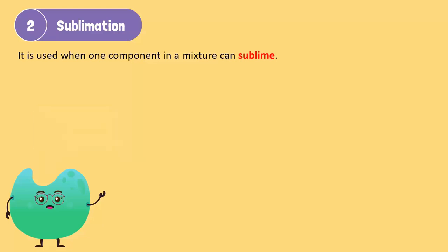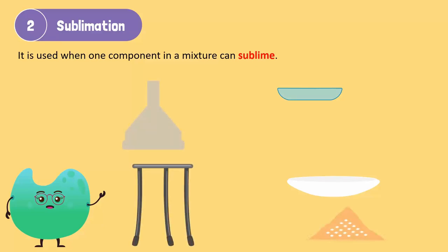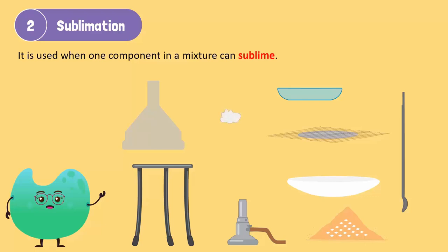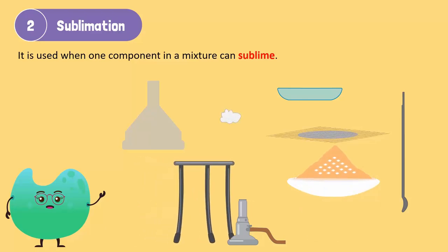Let's see how this works. Time to experiment. You will need a china dish, watch glass, sand and naphthalene mixture, funnel, tripod stand, spatula, Bunsen burner, wire gauze, and cotton. Put the mixture of naphthalene and sand in a china dish.